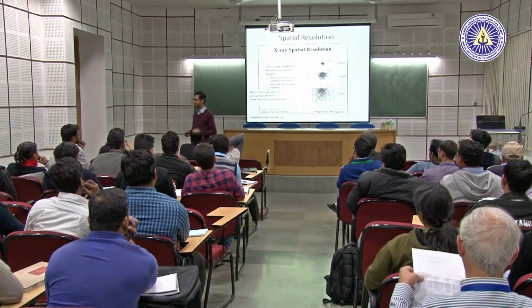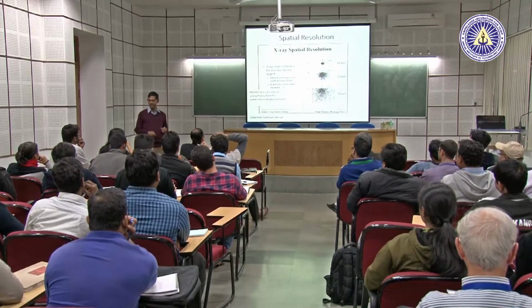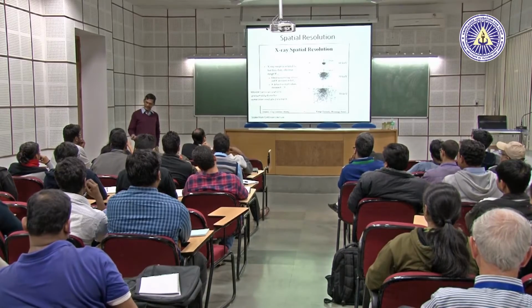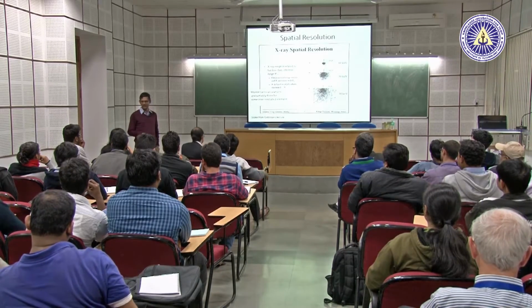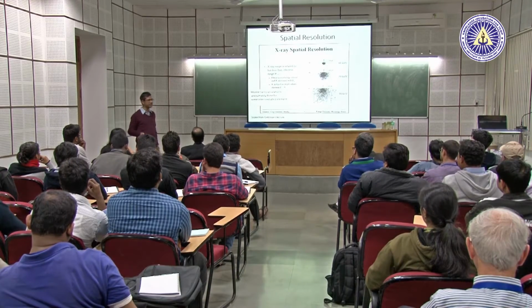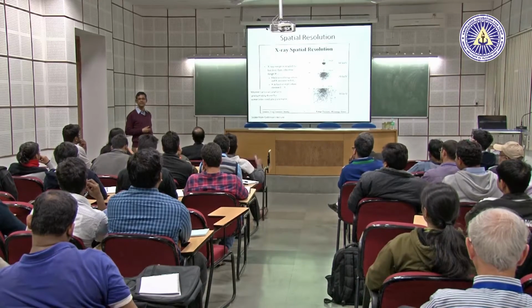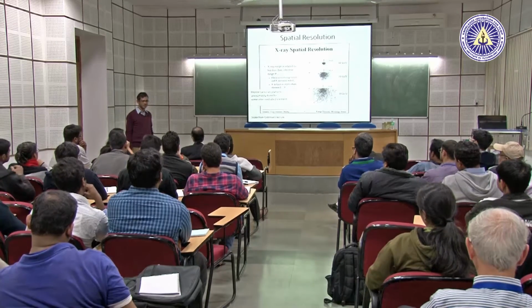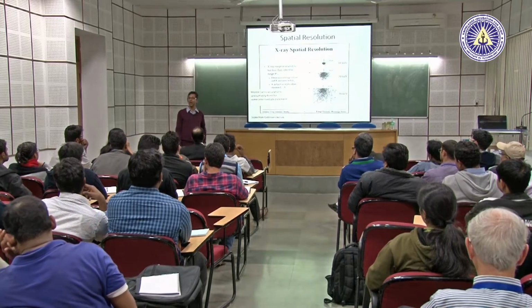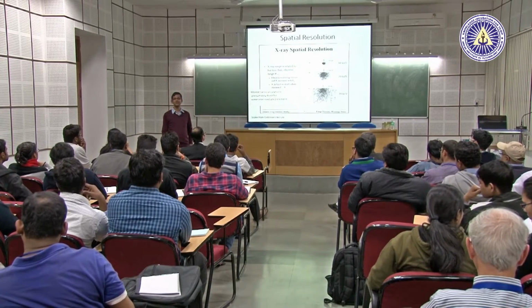So can we rely on that data? No. You have to go to WDS to rely on that data. Carbon is extremely difficult in any machine because carbon is obviously present in all samples. So whether it's coming from the sample or is spurious is very difficult to tell. Oxygen is okay, still better. Oxygen, nitrogen, you can do that. Even in EPMA they struggle. Carbon percentage is not reliable, because you don't know how pure your sample is, right? Yes. Any other questions?